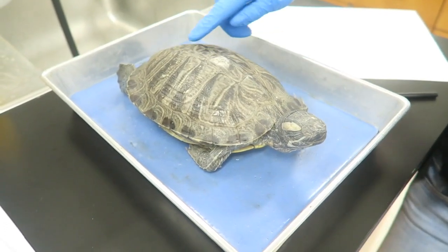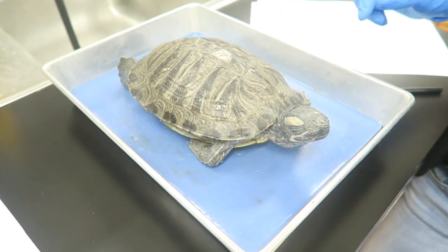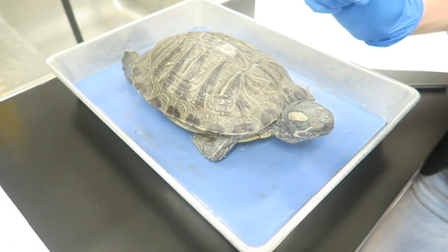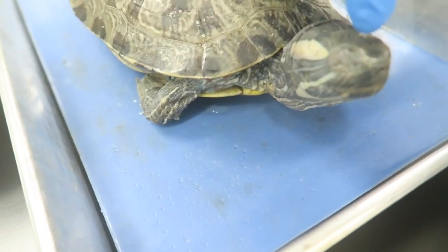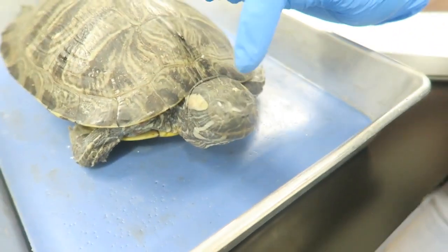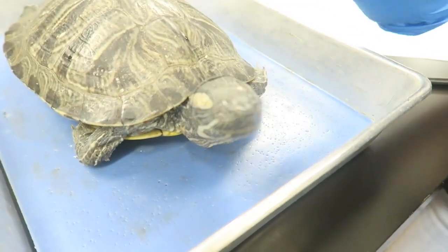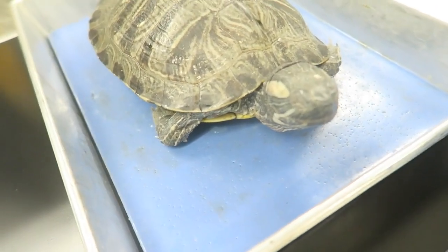When looking at the dorsal side of the turtle, or the back, you can see its eyes at the anterior end. The eyes have two eyelids which help protect it from debris, and there's actually a third eyelid at the front end of the eyes called the nictating membrane, which helps moisten and protect the eye. This adaptation allows turtles to dive underwater and still be able to see clearly without injuring their eyes.